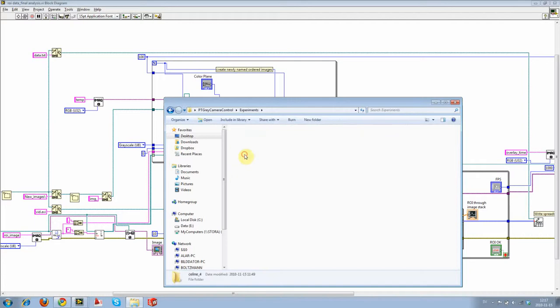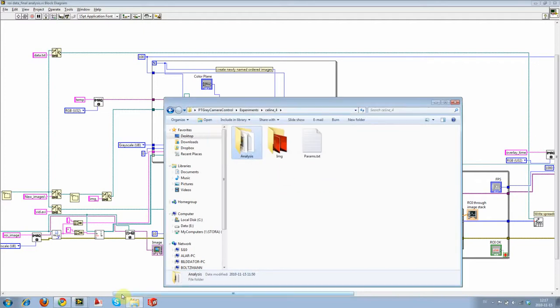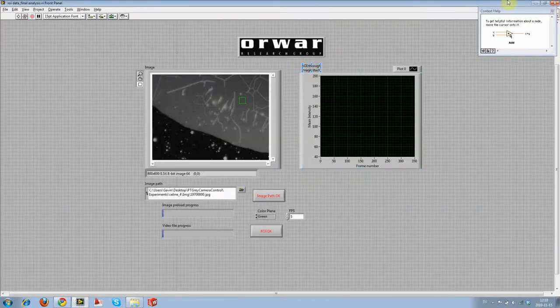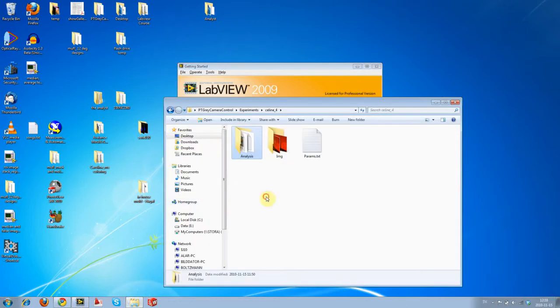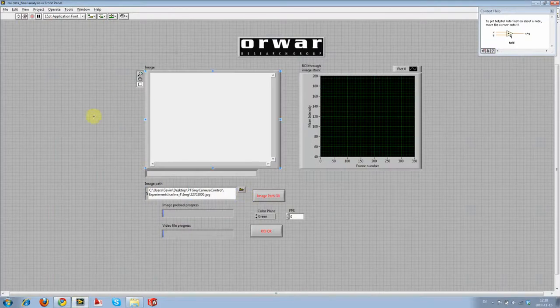Experiments 4. Okay. It says I've got it open. Let's do this. Okay. You don't normally have to go that far down. I don't know why I was being so picky, but anyway, let's try that again.